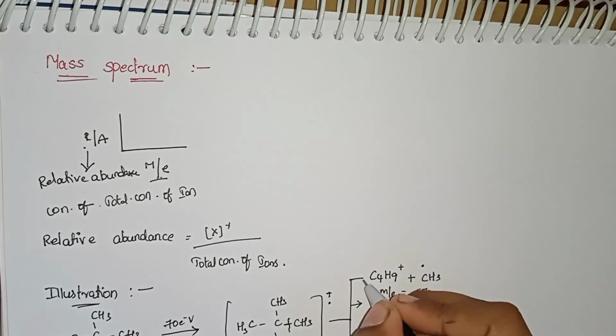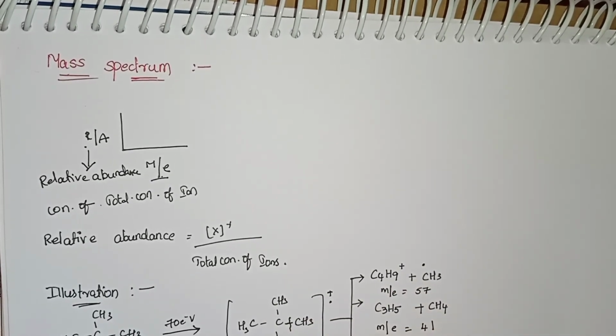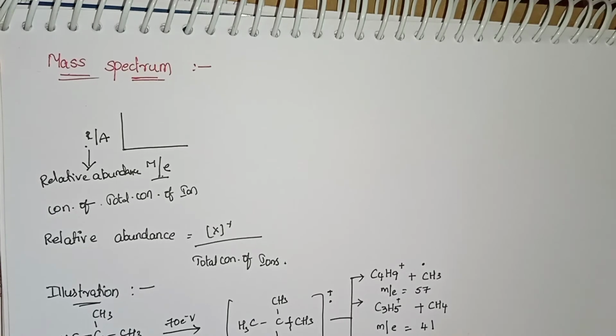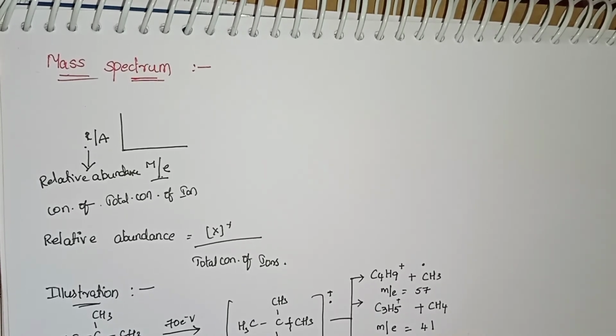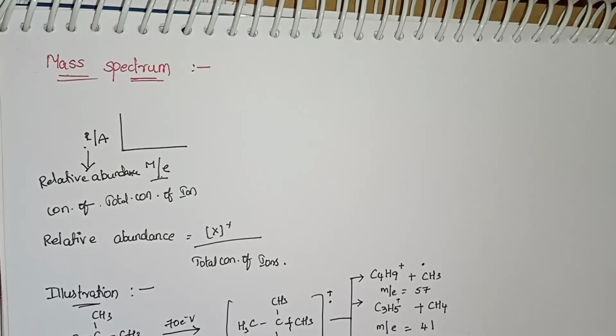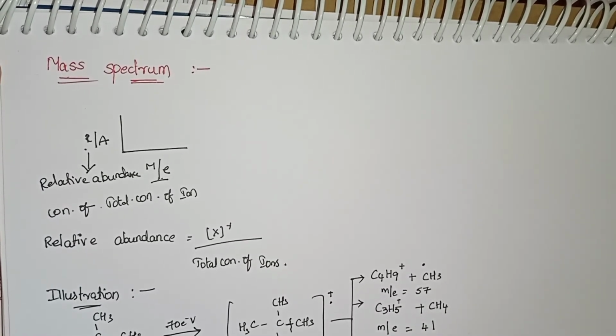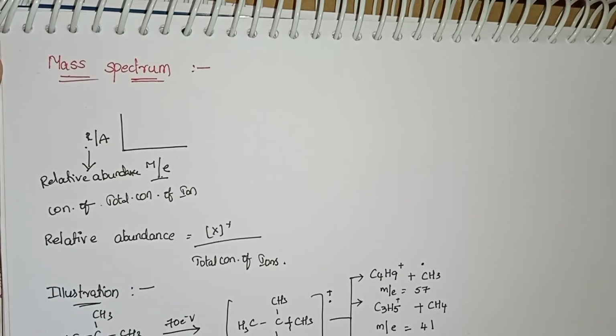Next, C2H5 plus, m/e value 29, and C2H3 plus, m/e value 27.